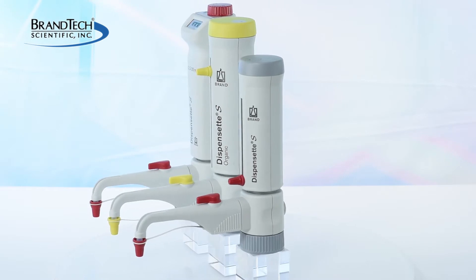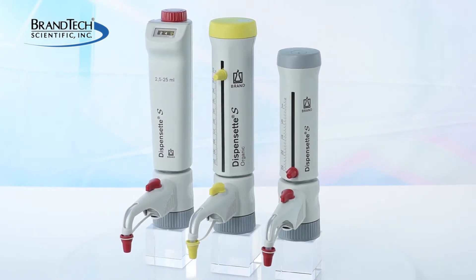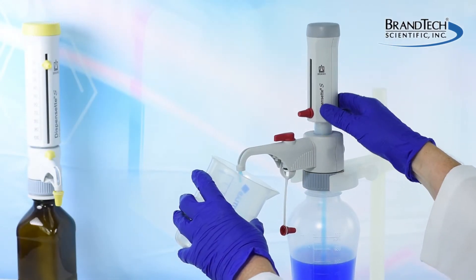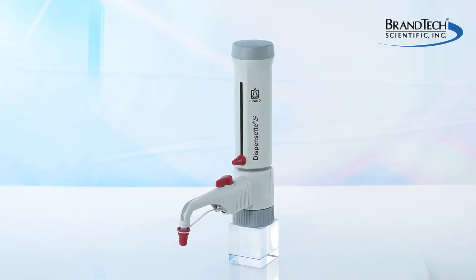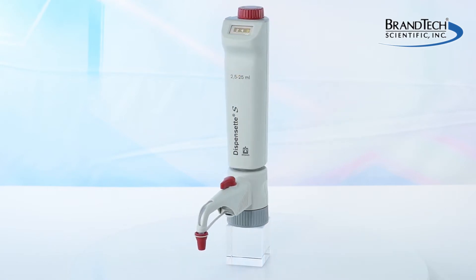Braun Dispenset S and Dispenset S organic bottle top dispensers feature a floating piston design. With proper care and maintenance, your Dispenset can provide years of reliable service. This video demonstrates the proper cleaning procedure for your Dispenset S, Dispenset S organic analog, and digital easy calibration versions.